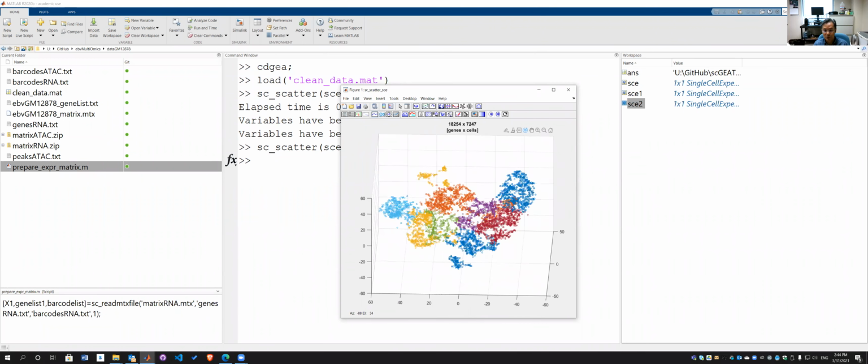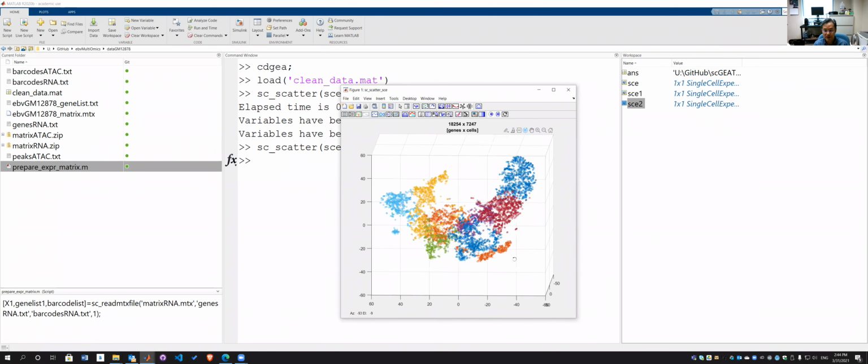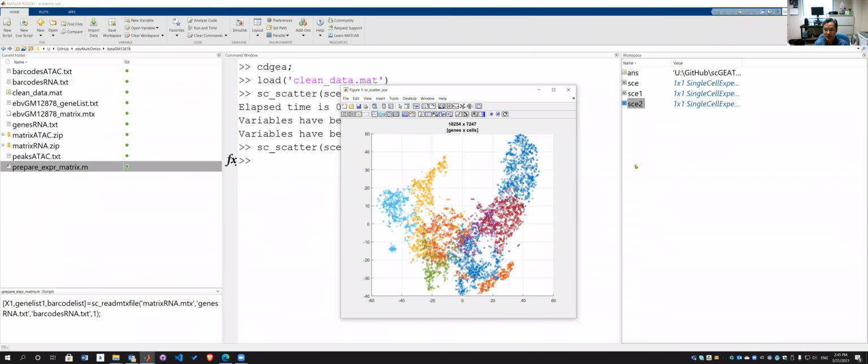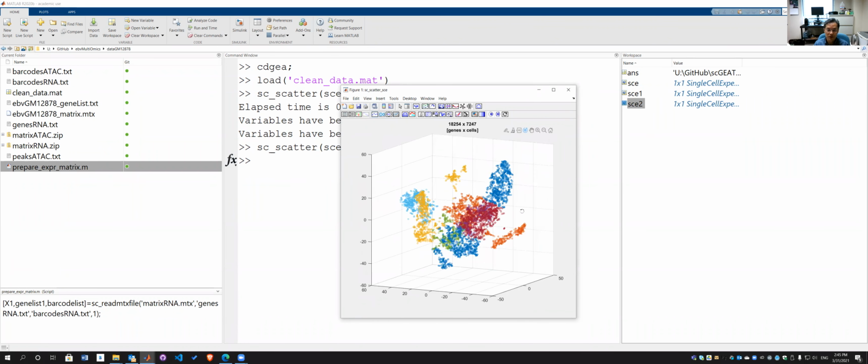However, if I want to view the difference between these two groups, I want this particular angle to be kept. So I will select current view projection, and that's my new 2D presentation of the cells. And you can see the separation of these three clusters. Okay.